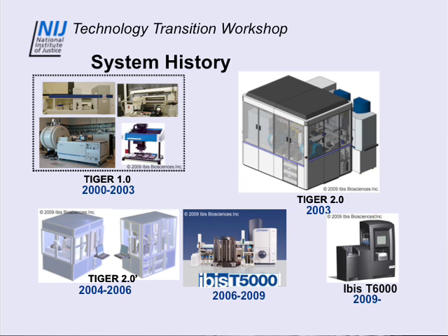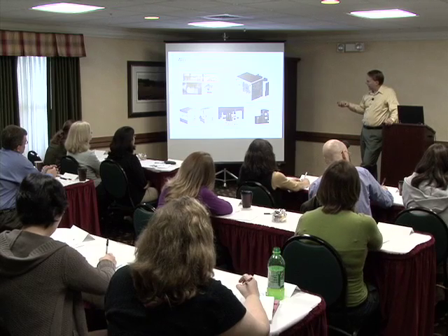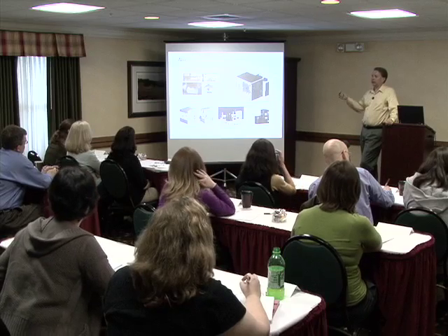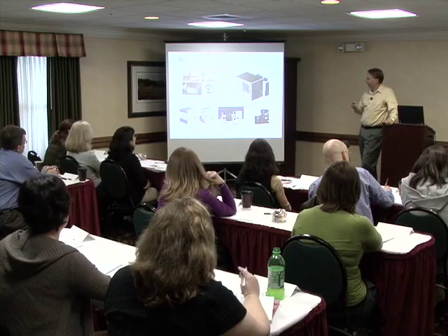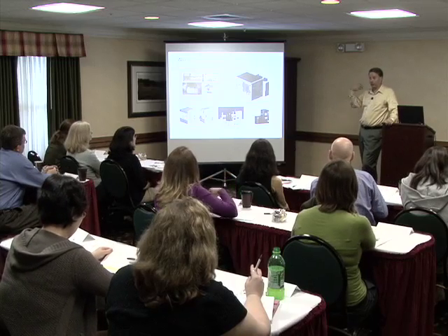The mass spectrometer we used was a very high-end Fourier transform ion cyclotron resonance mass spectrometer. It's like the Cadillac, the Lamborghini of mass spectrometers, which would take up about half of this room. It has a 7 Tesla superconducting magnet, cooled by liquid helium, cooled by liquid nitrogen, with a vacuum of about 10 to the minus 10 torr, which is lower than a space shuttle orbit kind of vacuum. Very, very much overkill for what we're doing. We don't need 1 part per million. We need about 25 parts per million.